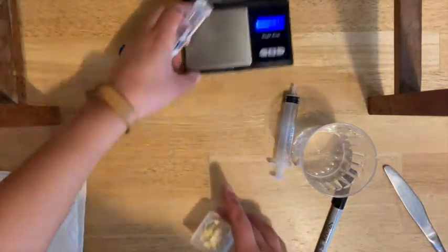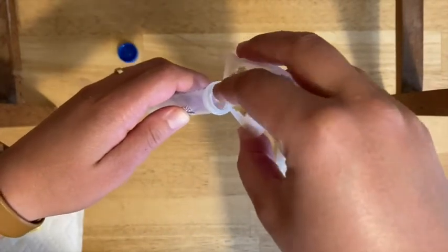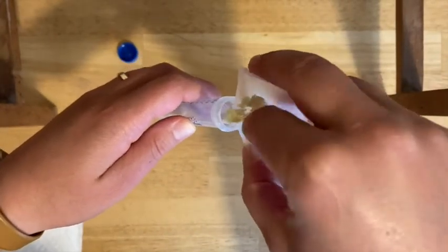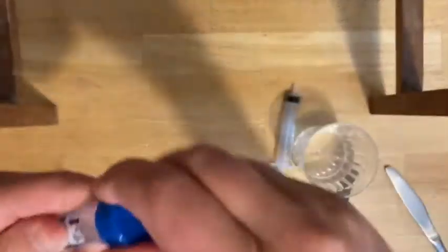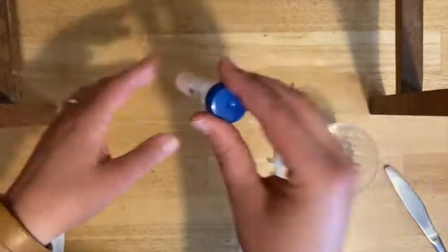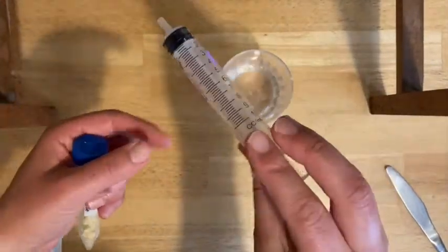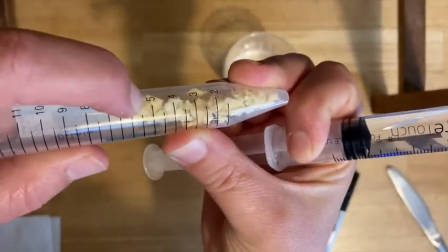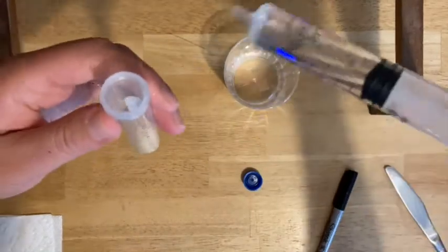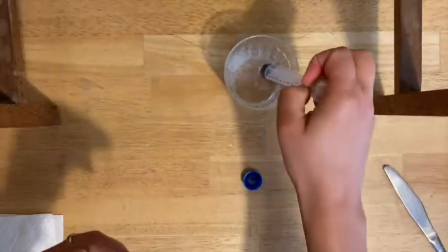Now you're going to rehydrate the pineapple. Take all the pieces and get them into your tube. Try not to lose any before you add the water. Tap it down a little to make sure it's all at the bottom. Then you're going to use your syringe and add just some regular tap water. You want to fill up to the five mil line. Try to be as precise as you can, but it may be a little tricky with the chunks in the way.